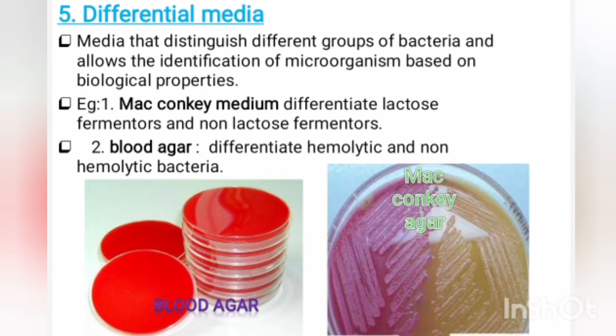Another example for the differential media is the blood agar. Blood agar is used to distinguish hemolytic and non-hemolytic bacteria. It is a type of enriched media and it is an indicator media.